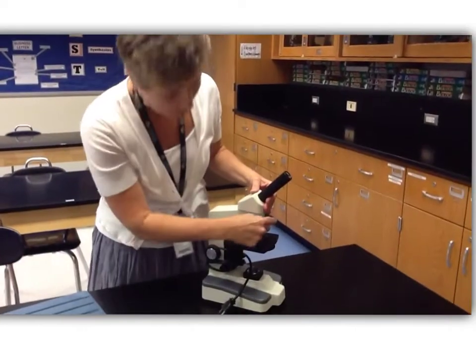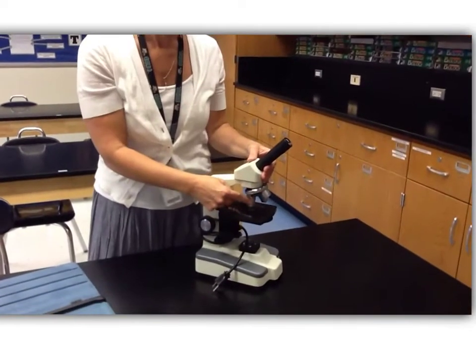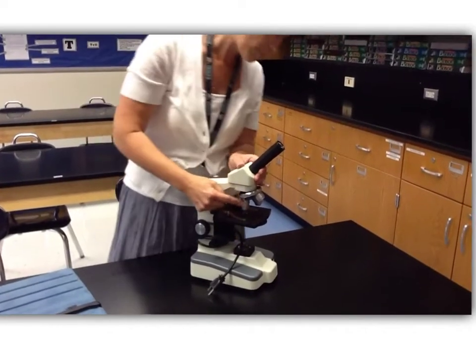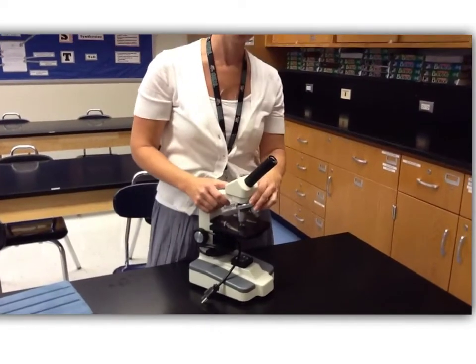We also have lenses down here, these are called the objective lenses. On most of our microscopes, there are three objective lenses, however, some of our microscopes only have two.